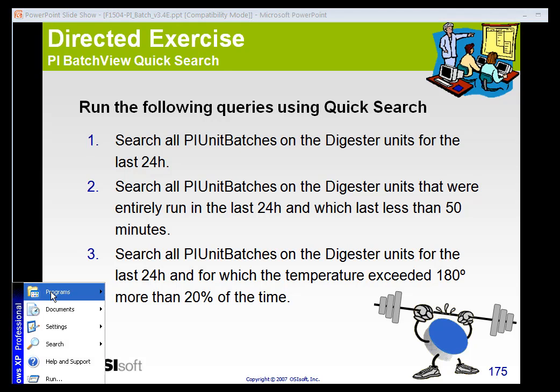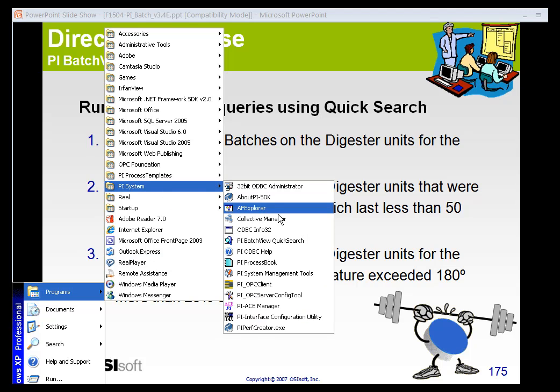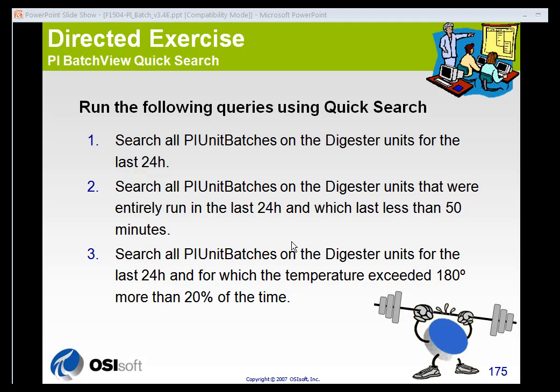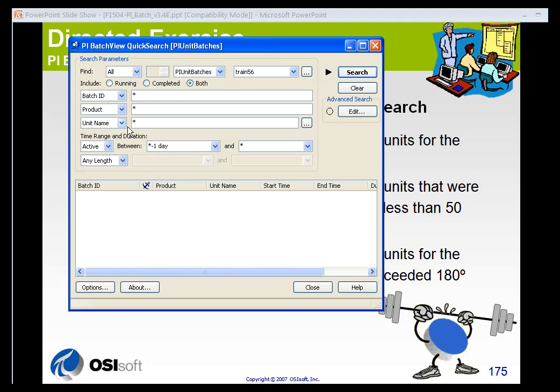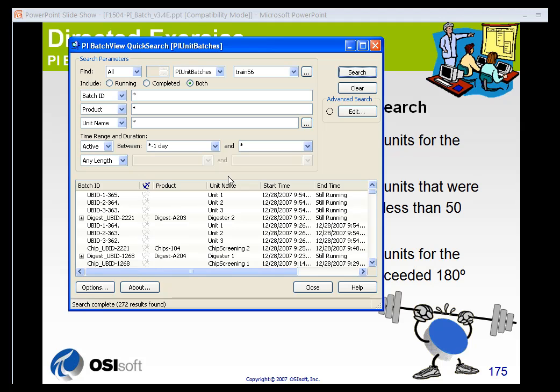Let's take a look at using the batch view quick search. I'm going to go to Programs, PI System, and PI Batch View Quick Search. When the application opens, I'm going to notice that I have asterisks in most of my fields. So I include both running and completed batches, unit batches on my server, and I'm looking back over the last 24 hours. And if I click Search, I'm going to return quite a few results.